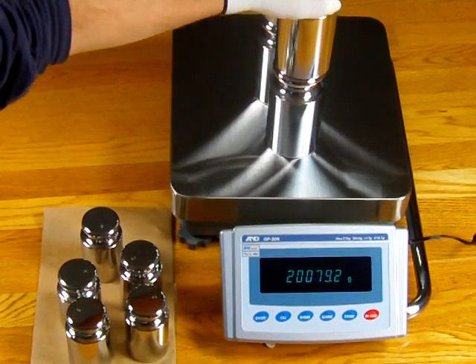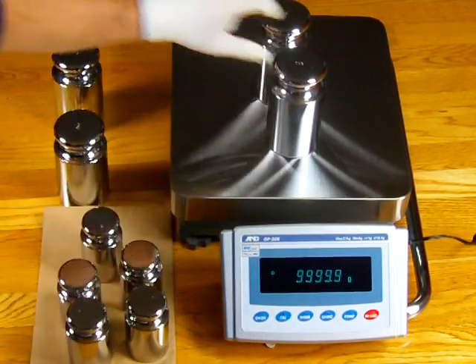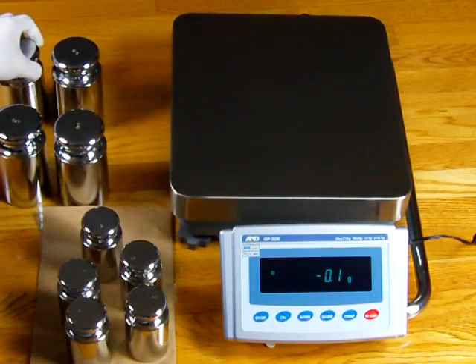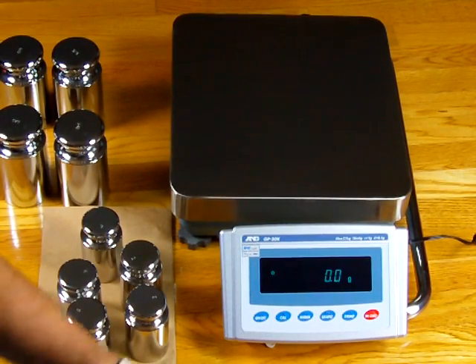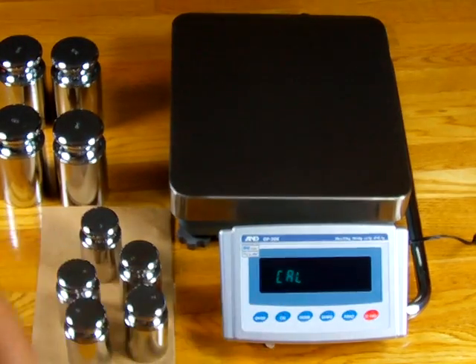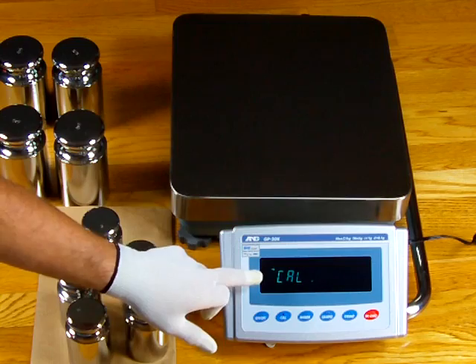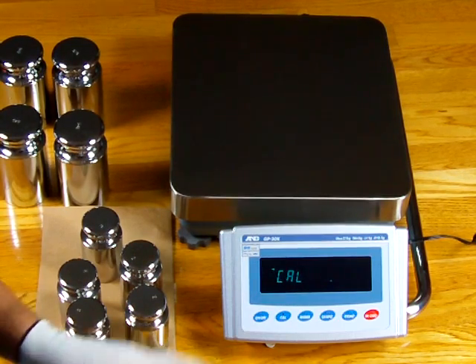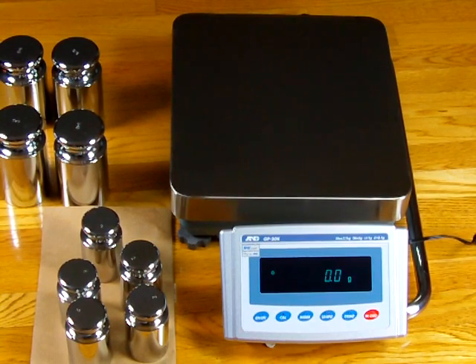I want to show you what happens when you use the motorized internal calibration. The calibration weights built internally are probably about a 600-gram weight using a lever-based system. So one would zero out the balance, then press the CAL button. You'll see CAL IN, and as the balance does the calibration, it drops the internal mass. You'll see in the upper left-hand corner an arrow, meaning it's storing the parameters at zero load, then it drops the weight down, stores the second value, and says END.